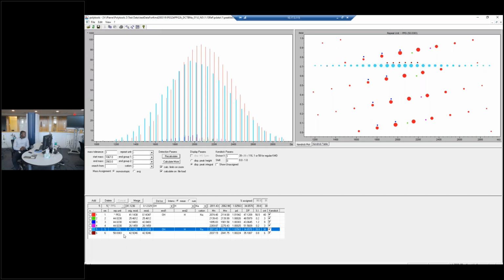And usually, there are two types of insoluble samples you can apply on a ground steel target. Something that's powdery mixed with the matrix, and all you need for that is just a little bit of that mixture, and you smear it onto the target pretty lightly. So that definitely won't cause any harm on the target.